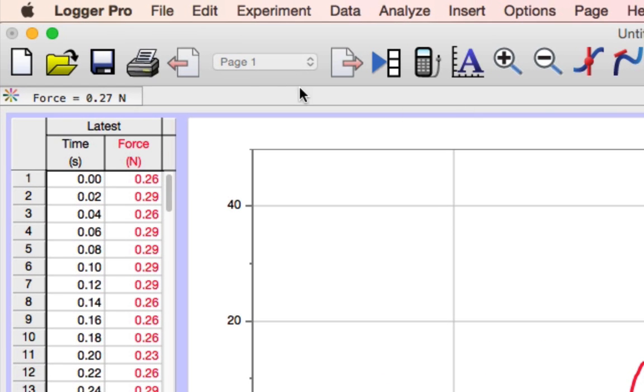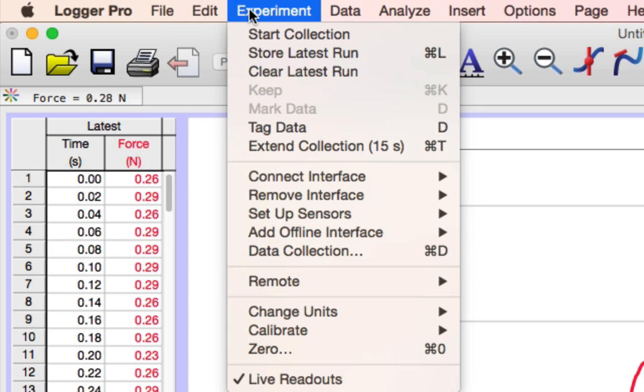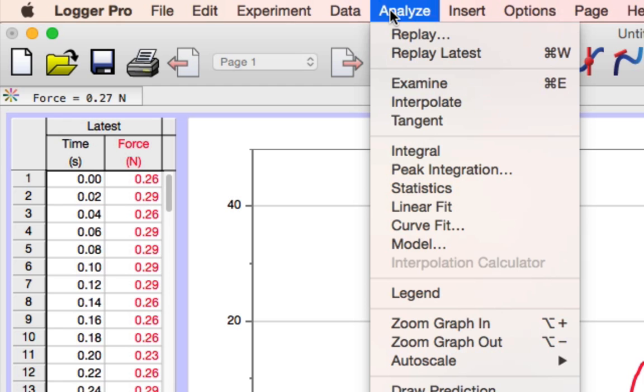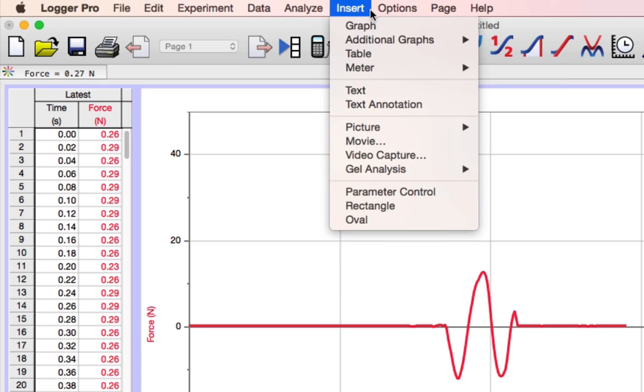Along the top, I have menus where I can adjust options for data collection, or I can do analysis of the data I've taken, or I can change the way the Logger Pro window looks.